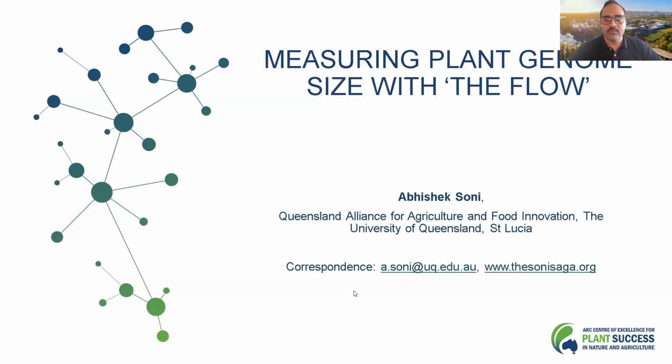So today's talk is about how we measure the genome size in plants using flow cytometry, which is a technique widely used in genome size estimation.